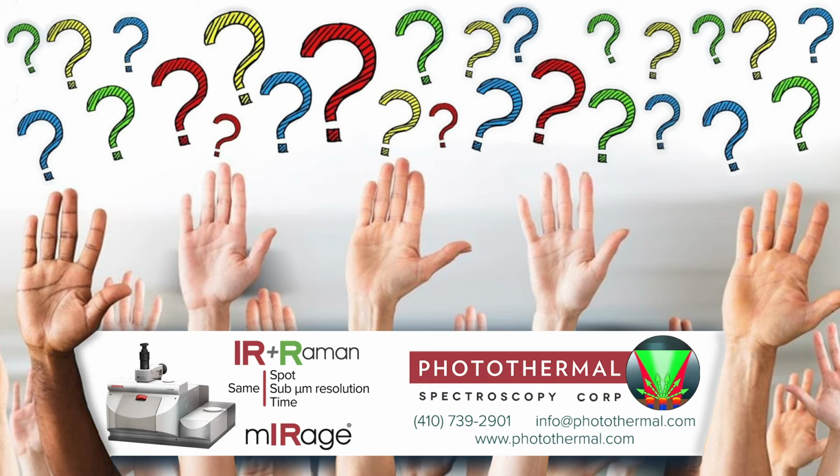Having said that, we haven't seen anything that looks out of the ordinary. So I'd be interested to know where we might find those things. Yeah, you can see cytochromes. In resonance Raman, for example, I work with bacteria, and they produce a lot of pigments that we can see due to the resonance Raman effect.